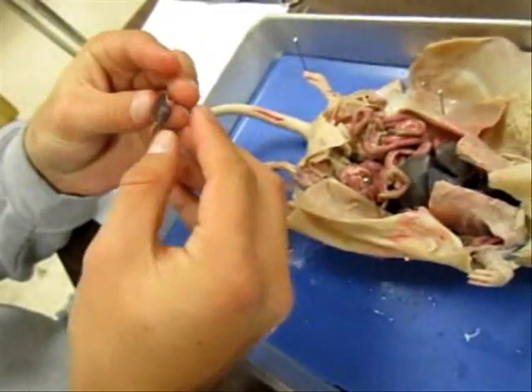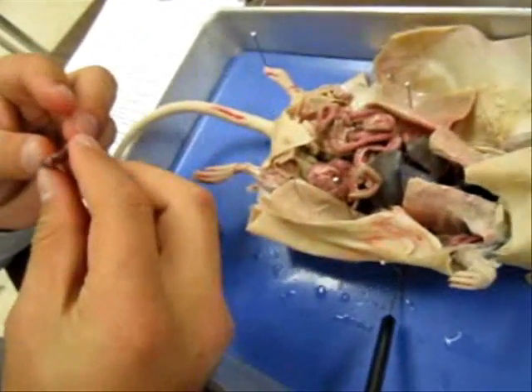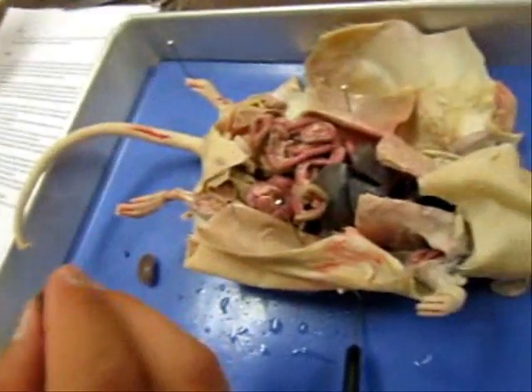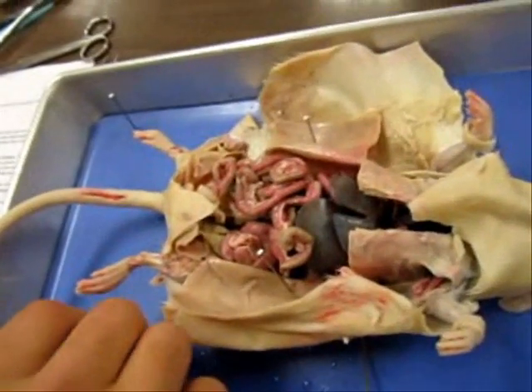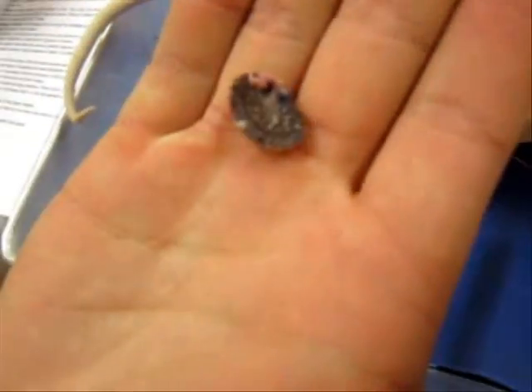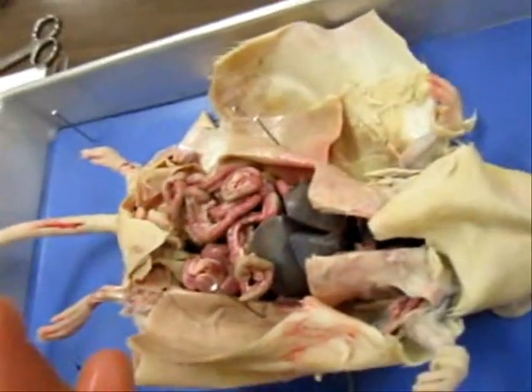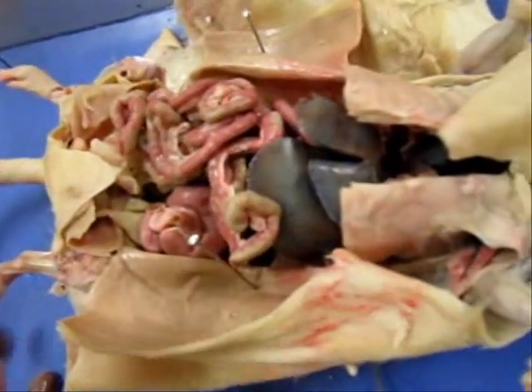Alright, the kidneys are primary organs. This is the inside. It's pretty sweet. It's got all the blood circulation. They're one of the primary organs of the excretory system. They look like little beans, as you can see. And within the kidneys, you can see very fine veins and arteries, which I was just showing you. Blood is filtered through the kidney on average once every 45 minutes.